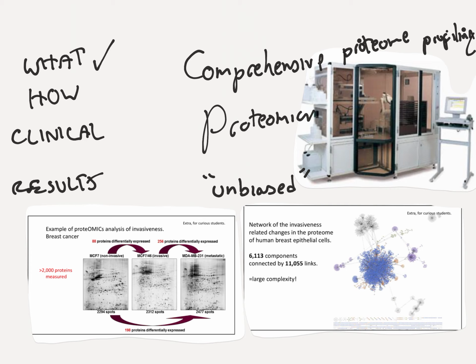Now let's look at how it's done. There aren't many details, but the point is, you take a sample and you put it in this huge machine called a robotic station. This huge magical pit that just gets the work done for you. We call it a robotic station, and there's actually a picture right here. You can find it in your third lecture. Anyway, the point is you have three main steps.